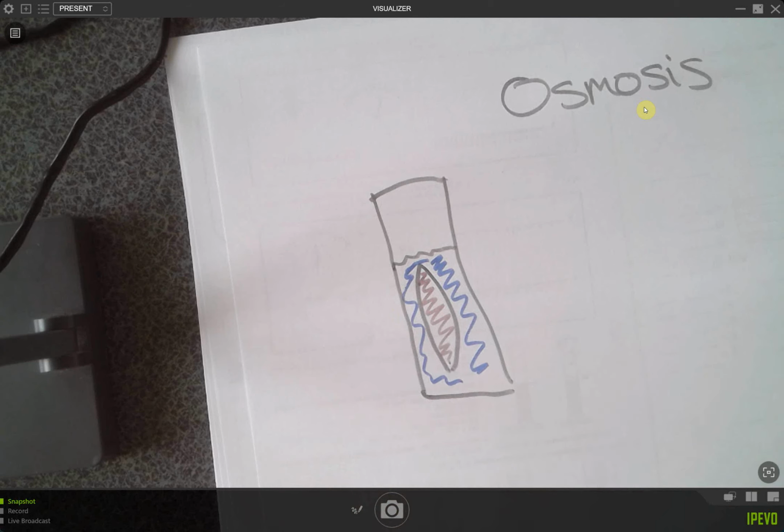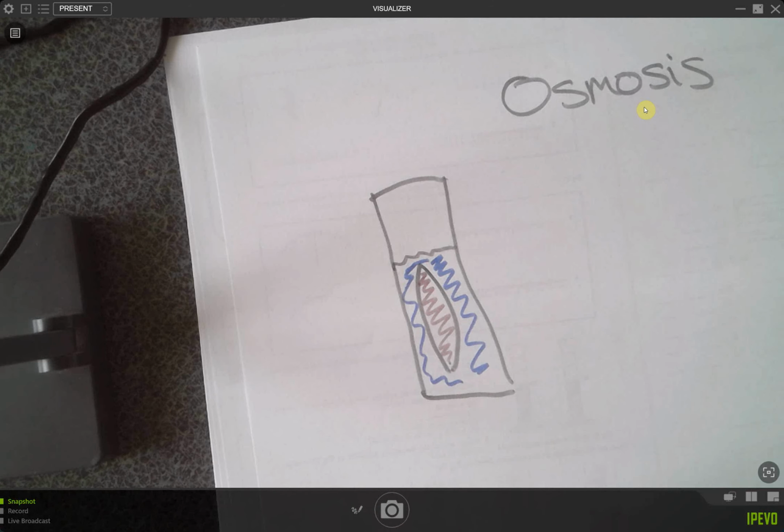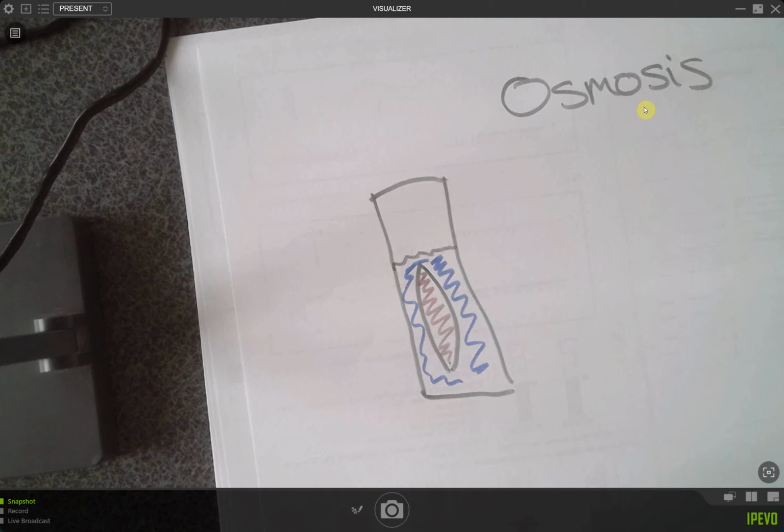And so what we saw was this bag, it's not like a normal typical plastic bag, it's actually what we call semi-permeable. So that means it lets some things through and it doesn't let other things through. So if you tied it up correctly, there shouldn't have been any sugar coming through, but the water can still move. All right, does that make sense?